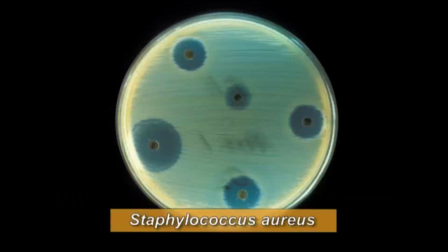Here the standard organism that is used is Staphylococcus aureus, and it is tested for its ability to be killed within 10 minutes but not less than 5 minutes. It means the duration of time needed to kill the organism should lie within 5 to 10 minutes. The concentration at which the organisms are killed within this duration is noted down, and it is compared with the concentration of phenol that does the same work in the same time.